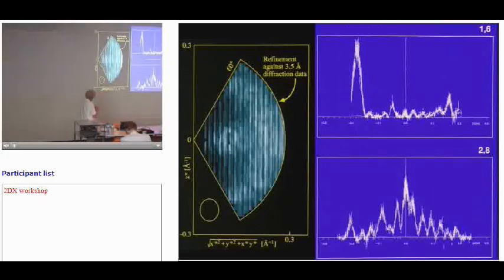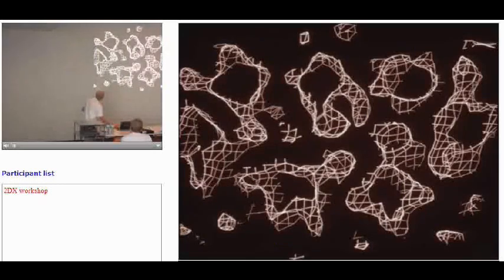And this is some examples of electron diffraction, which I'm not going to talk about, two particular spots in bacteriorhodopsin as you tilt. And you can see the diffraction, the Fourier components coming and going, different Fourier components. And the big peaks at 5 angstroms come from the fact that it's helices, and they have about a 5 angstrom pitch. So here is the diffraction. Here are all of the lattice lines averaged, untilted, and we only went up to 60 degrees. And the 5 angstrom axial is here, so you miss quite a lot of it. This would be the 10 angstrom helical packing, and then this is the 3 to 4 angstrom side chain packing. That was the same map I showed you before, phenylalanine.